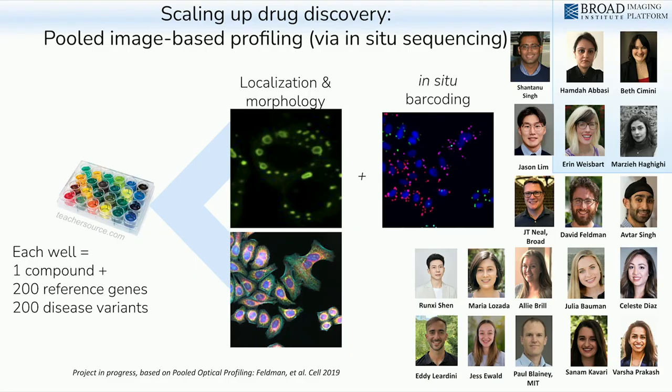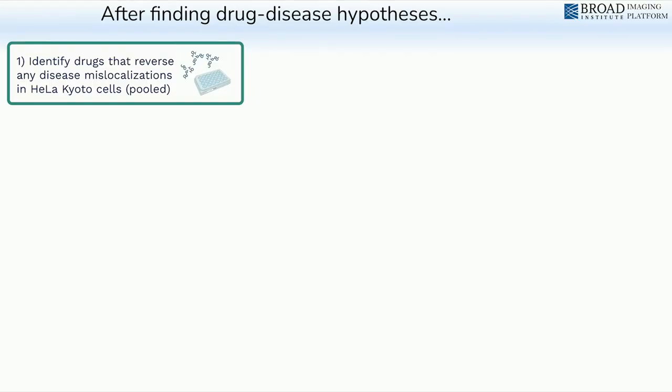This is how we work around doing 100 or 200 separate drug screens. Instead, we pool it all. It's not as high throughput as an individual drug screen would be, but when you consider that it's 100 screens in one, it's really quite nice.